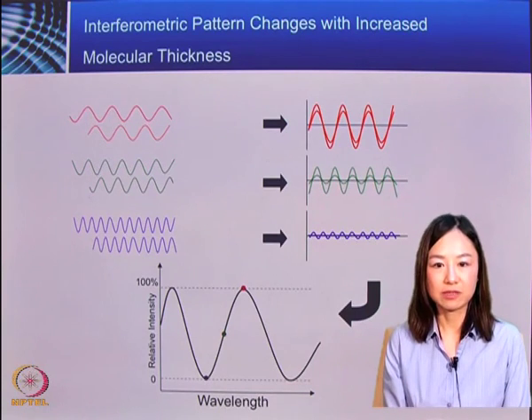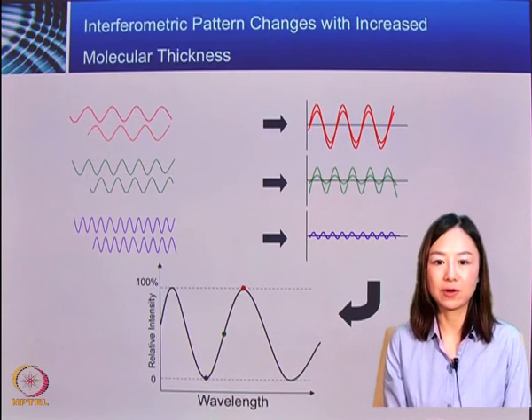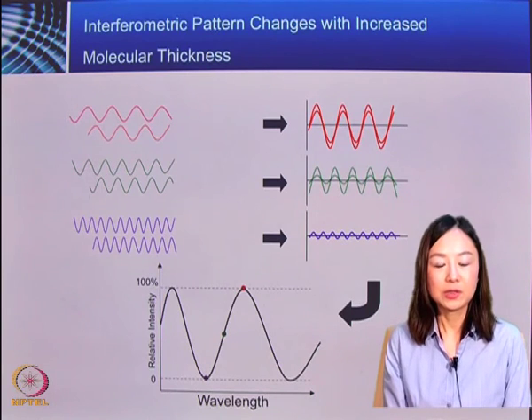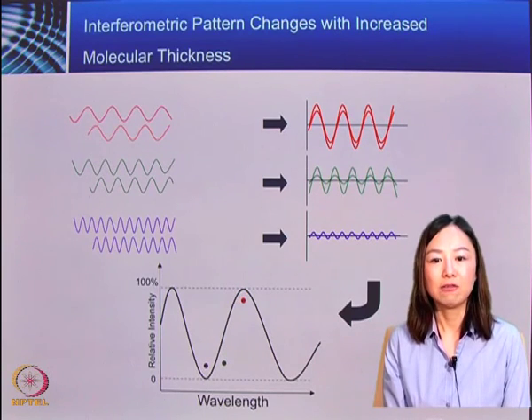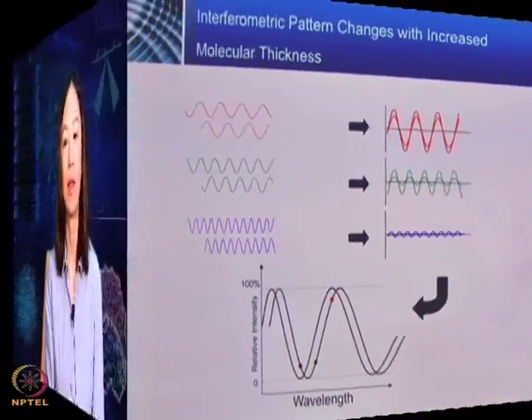The distance of the shift is proportional to the size of the molecules on the membrane, the amount of molecules bound on the membrane, and also the density of the molecules bound on the membrane. So the system will monitor this wave pattern shift in real time, and from there we can get an understanding of the details of the biomolecule interactions.